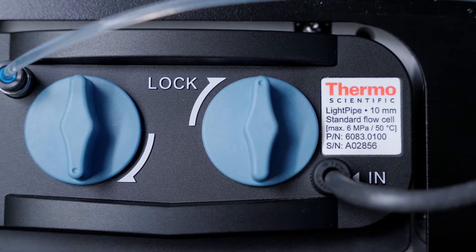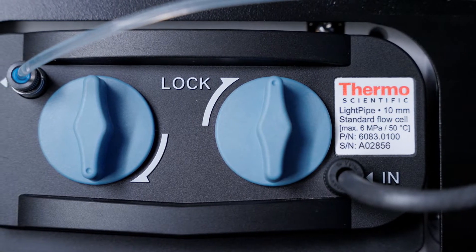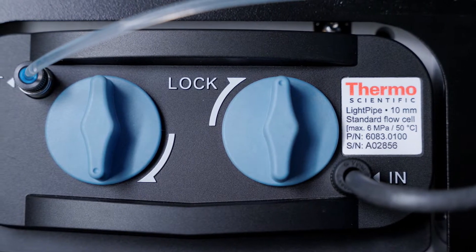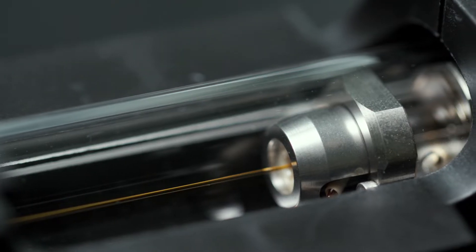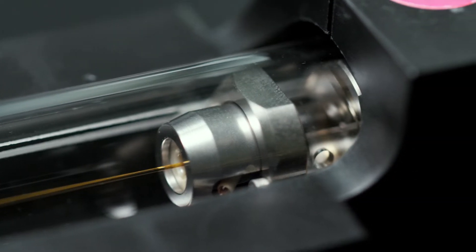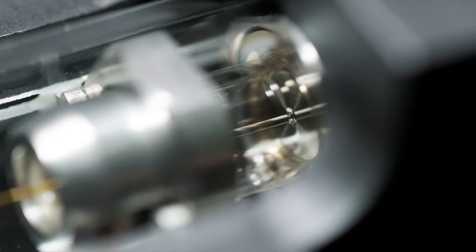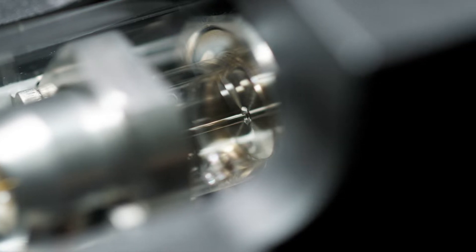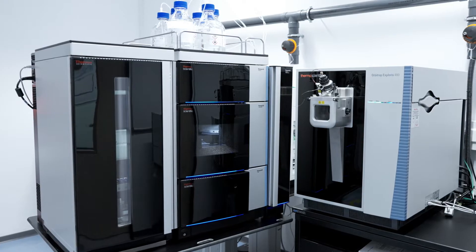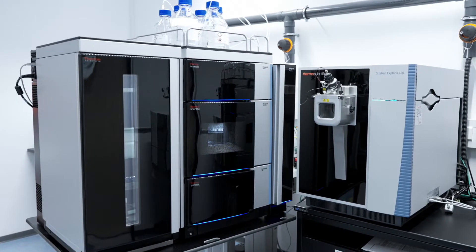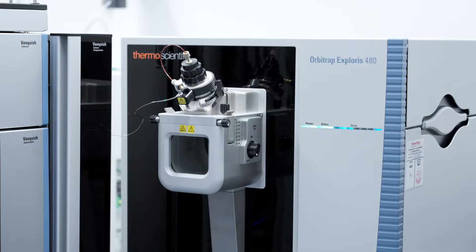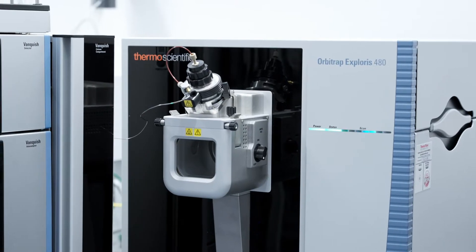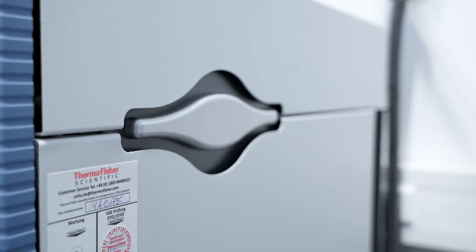For optically inactive analytes, charged aerosol detection enables universal detection of non- and semi-volatile compounds, as well as standard-free quantitation. In addition to traditional detection methods, take advantage of the best-in-class Thermo Scientific mass spectrometer portfolio.